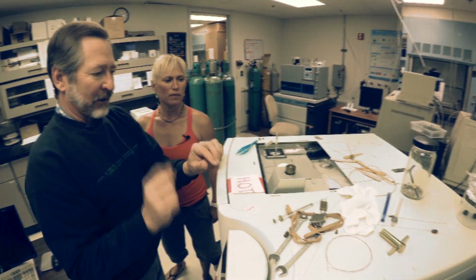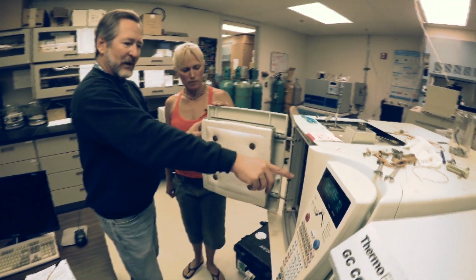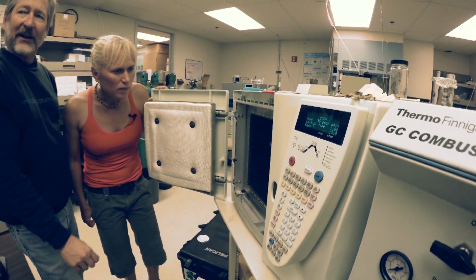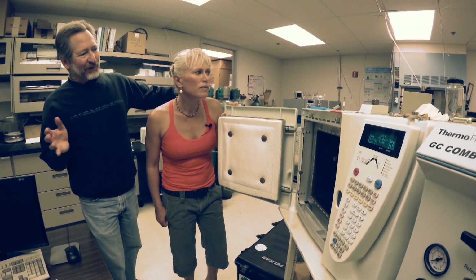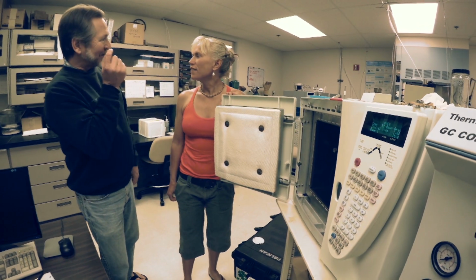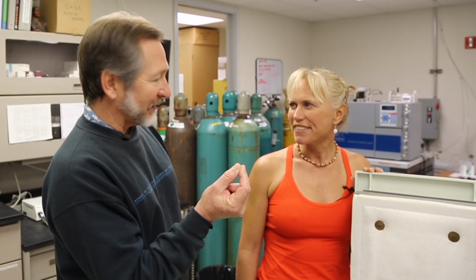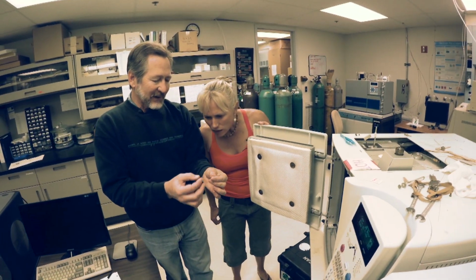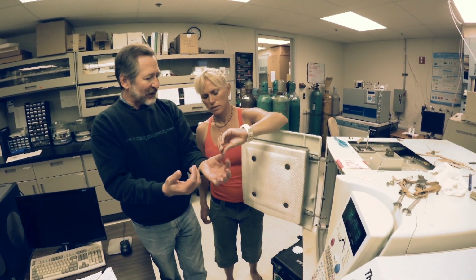And where that goes is it goes into something called a gas chromatographic column. This column is 60 meters long, but it's hollow. It's like a tube. And that tube, the inside diameter, is only 1/3 of a millimeter. You can maybe fit about 4 or 5 of your hairs in there, but not many more. That kind of brownish coating is an organic film that the compounds interact with.